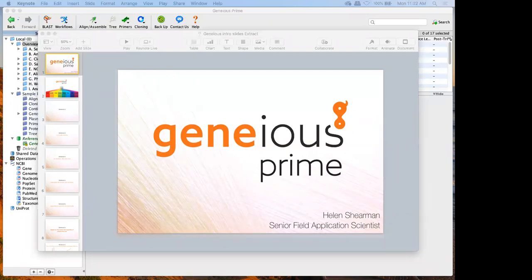Thank you. So hi, everyone. Welcome. My name's Helen. So today I'm going to give sort of a general overview of Geneious, tell you a little bit about how it works, just where things are, and then we're going to talk about some of the various functionality, some of the various tools available. As we were saying earlier, you don't need to follow along with Geneious on your computer. You are welcome to if you've got it open, but you don't need to. The session is also being recorded, so if you want to go back later on and work out what buttons we were using, you'll be able to review the recording.